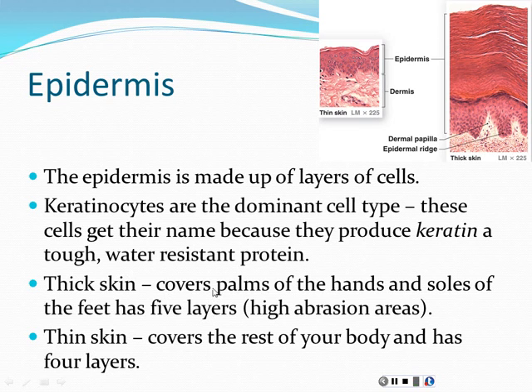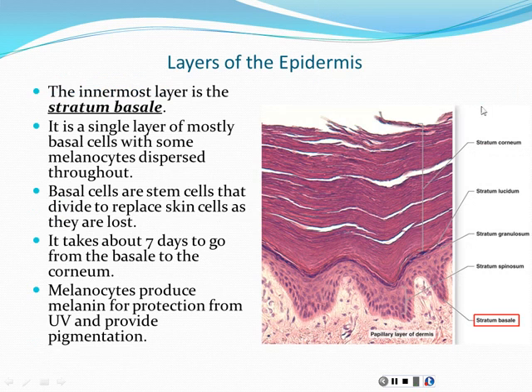Okay. So, let me just turn this off so we can see our picture. So, this is looking under the microscope. Okay, so here's the epidermal layer right here. See, there's a dermal papilla right here, or a hill. Underneath here, this is the dermis, and then all of this up here, this is all dead cells that are full of keratin. So this is the keratinization. But what we're going to talk about here in the next few minutes is the layers of this epidermal region.